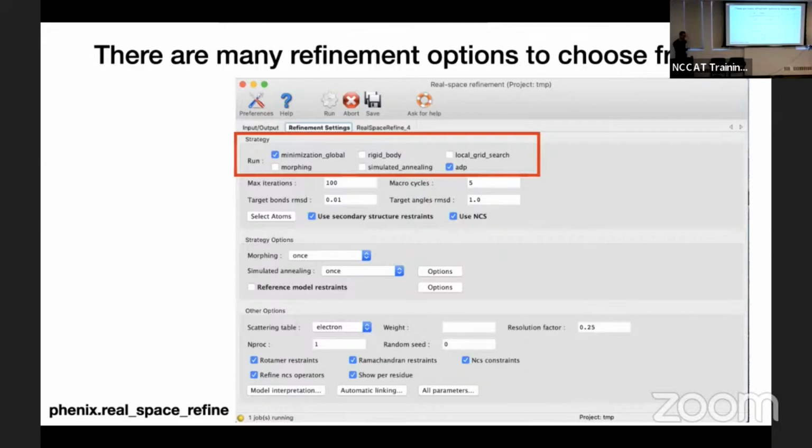I think with all stages of the cryo-EM structure determination process, there are multiple software packages, and sometimes one will work better than others, right? And the same can be true for refinement. So definitely explore other options.